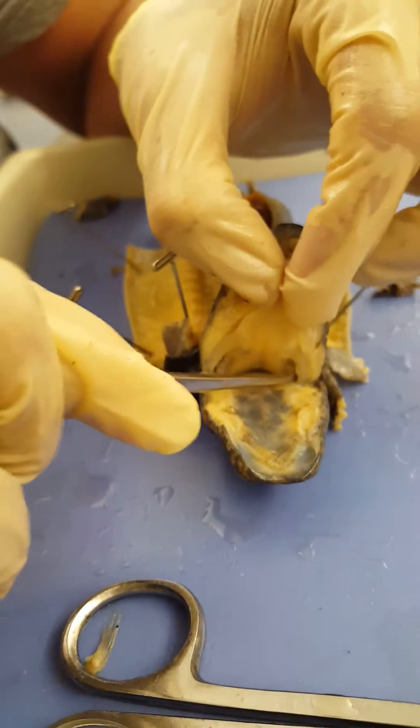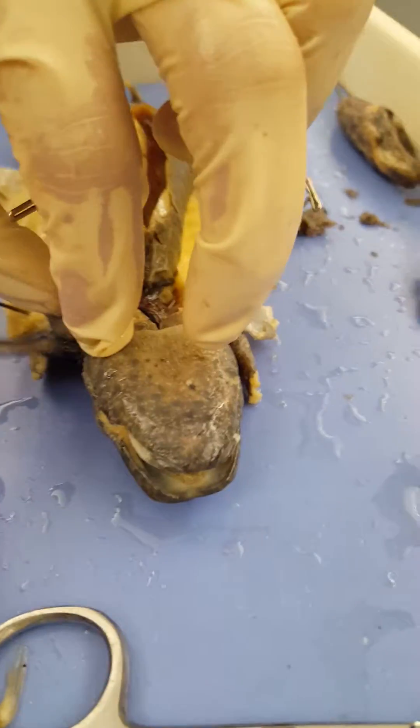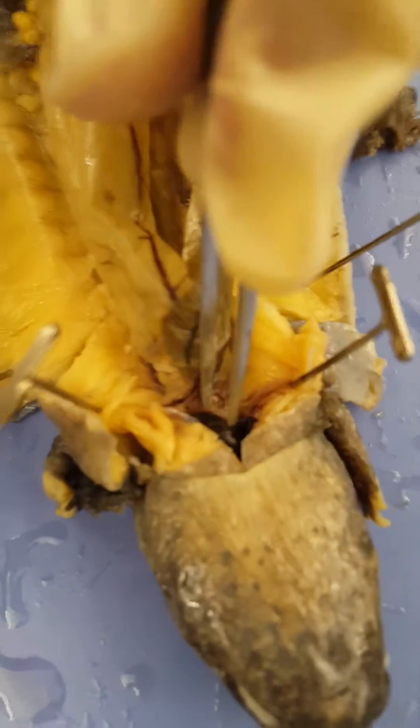So, this is the salamander. Here is the pharynx right there. It goes into the external gills. And here is the heart.